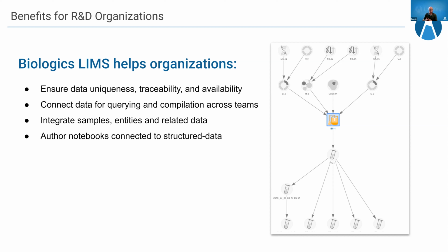And if you have to do that every day, I would strongly recommend that you not lock critical information into unstructured notebooks. It makes it very difficult to solve some of the previously mentioned problems, and many other forward-looking issues that you're likely to run into. If you make use of LabQ's Biologics LIMS, make use of our data connected ELN, all of that compiled and connected data that I have been talking about can be referenced in your notebooks with just a couple of keystrokes. And I promise that having your data structured will also prevent myriad problems for your data scientists, among others, as you grow.